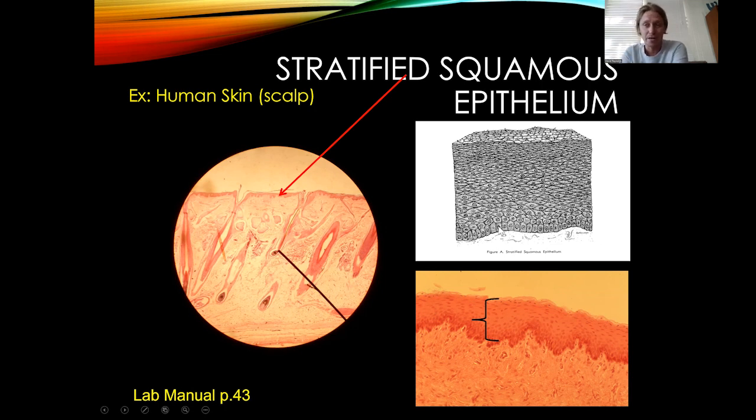We say this is the mitotic layer because these cells are constantly undergoing mitosis and creating new cells. And that's actually how this whole thing works. So you make a cell down here through mitosis and push that new cell upwards, and it creates this kind of conveyor belt moving upwards, which means the cells way up here are the oldest cells. They were once new down here, but they kept being pushed upwards, and now they're the oldest. And that's why they become squamous, because they're slowly dying and losing their parts to their cell.